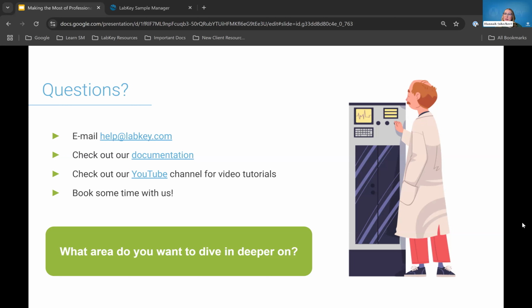No, that's actually not something that we've hooked up yet, but I could imagine having that utility, being able to find things. One of the things that we do want to build out more is the ability to find samples based on what workflows they were part of. I could imagine doing the same for Sample Finder, with what ELN templates or what metadata was captured in that ELN, as another really good feature for us to think about.